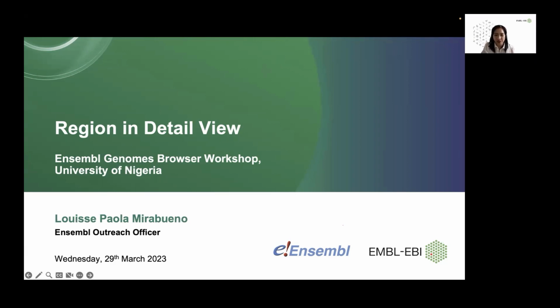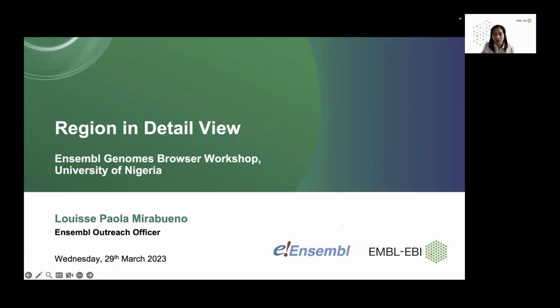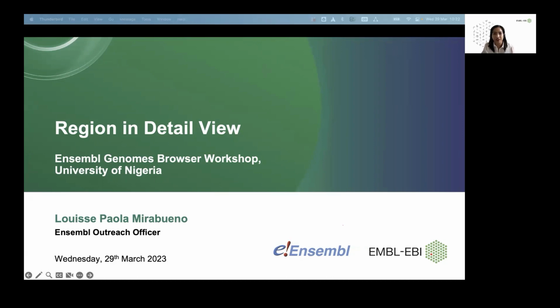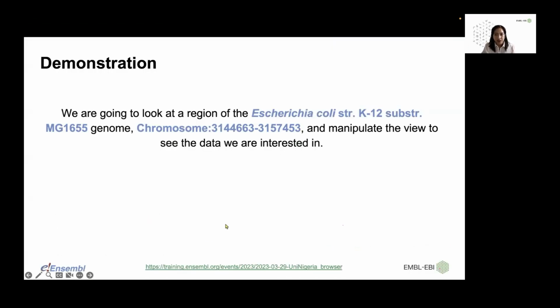If you have questions, please put them down in the Zoom chat box, or in the living document. For this next module, I will show you how you can view a specific region of a genome in the Ensembl browser. For this, I'm going to go straight to a demonstration.